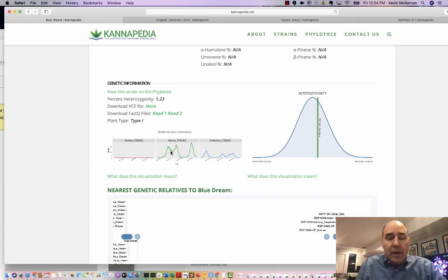in your genome. So that's what these plots are depicting here: your Illumina sequence coverage over the CBD synthase gene. That's on contig 1772 in the Jamaican line reference. And then it's also looking at the DNA sequence coverage over contig 7741 in the Jamaican line reference, which has THC synthase in it. It also has a neighboring gene that looks a lot like CBD synthase but is broken. This is what we call inactive CBD synthase, all right?